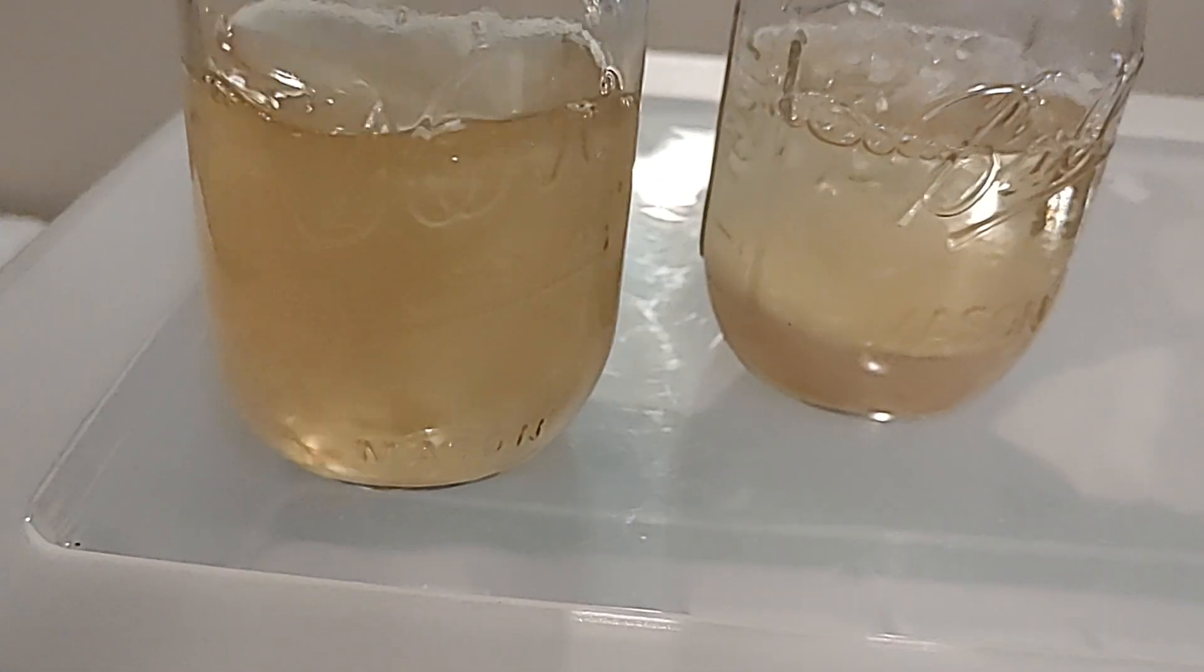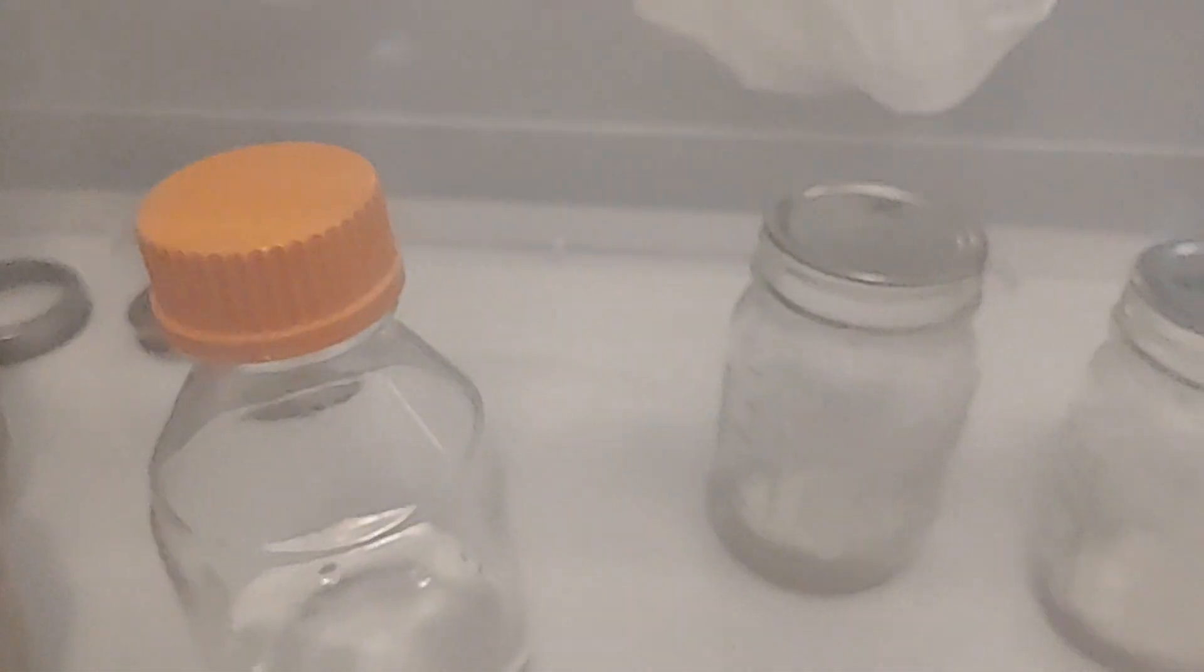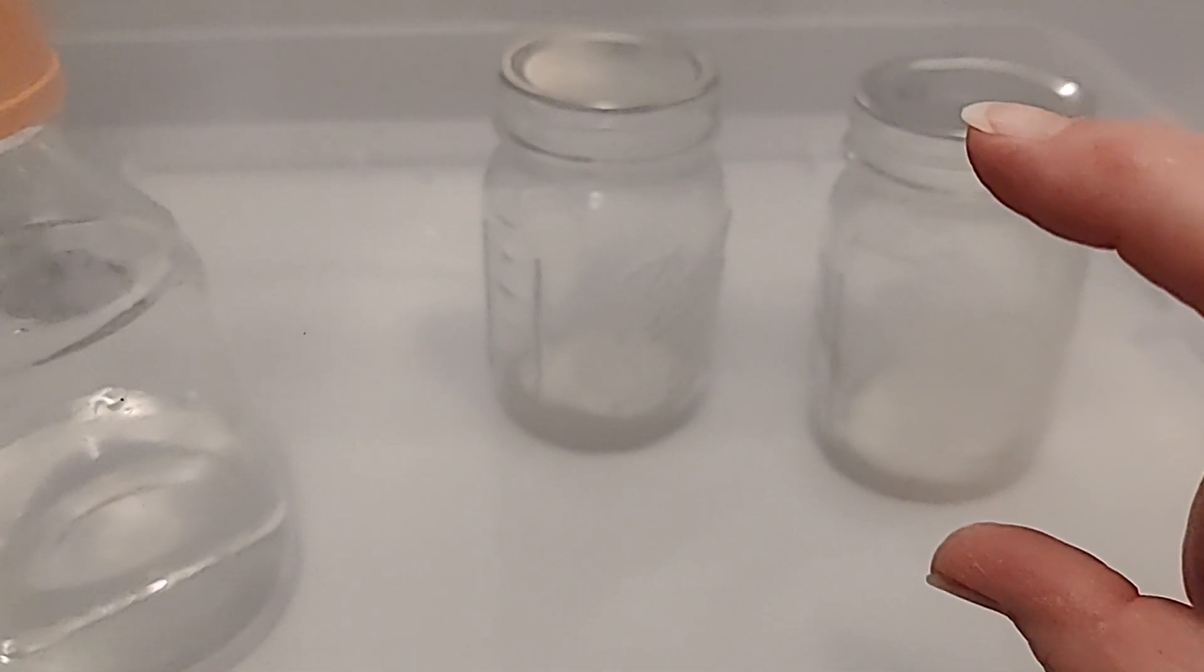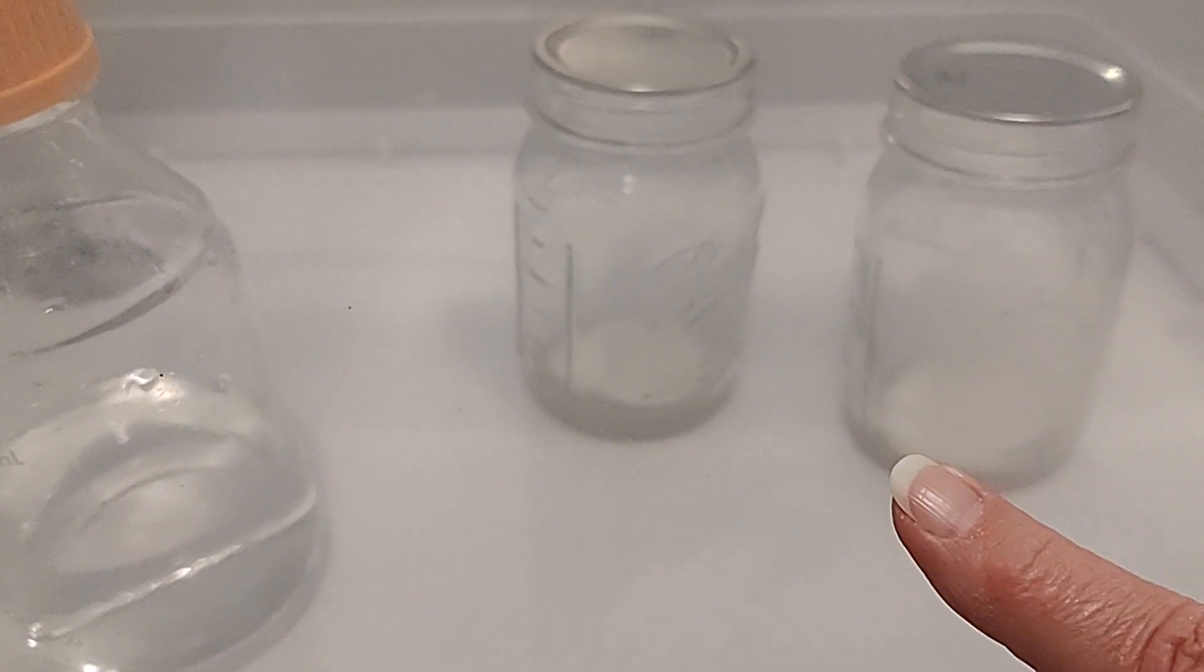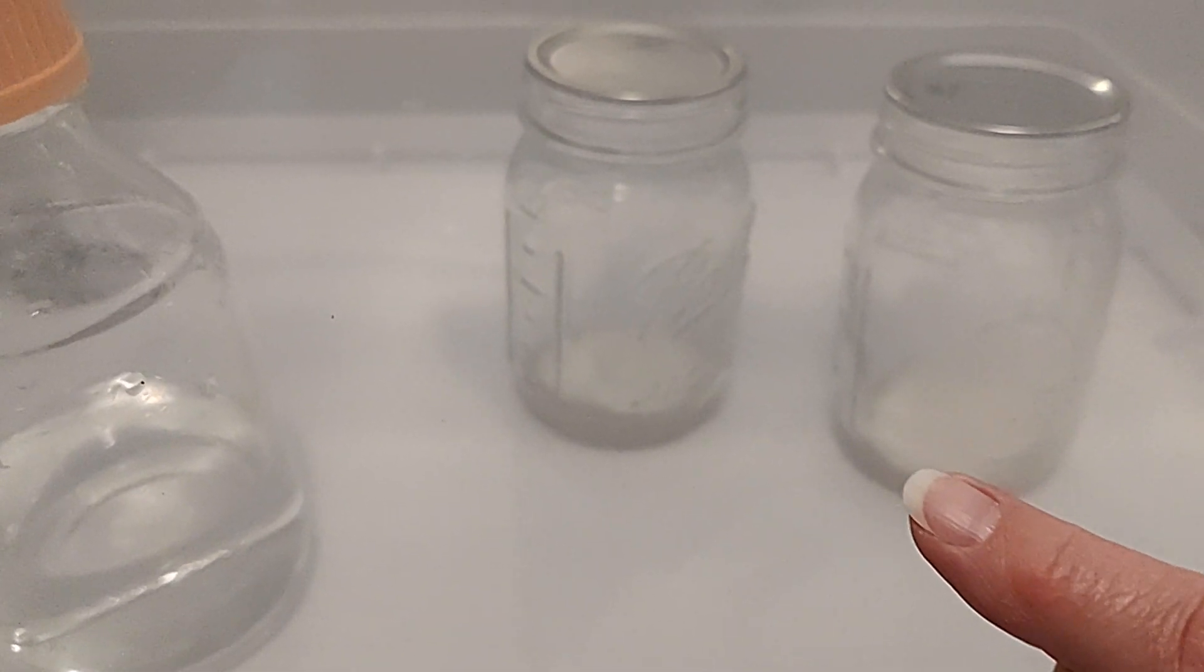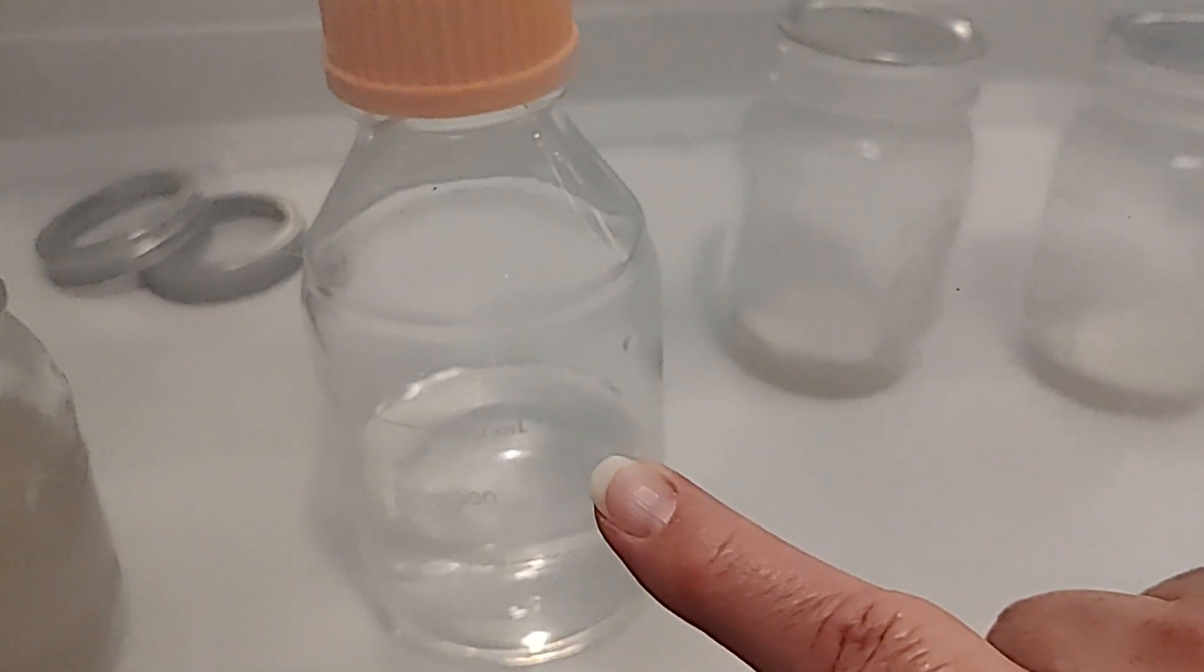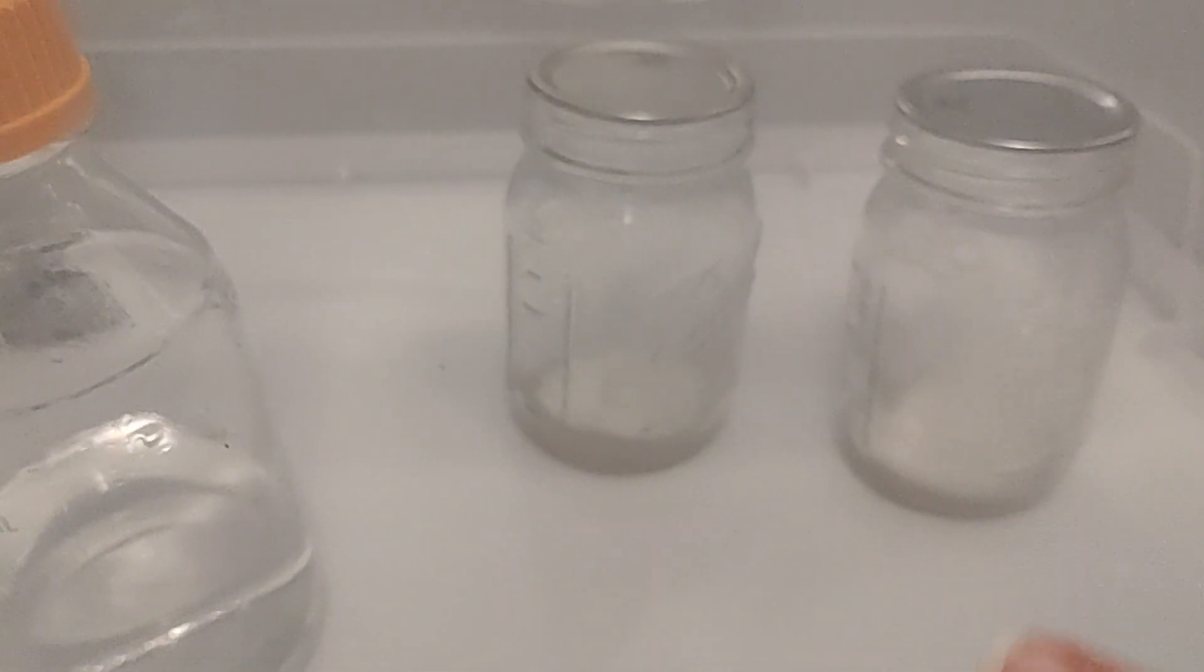The idea on the slurry is that you pressure cook it inside this large jar. It's a tiny little petri dish down there, an agar dish. So we pressure cook it, then we do our transfer, then it grows out to the edge, and then you pressure cook your purified water so there's no contamination.